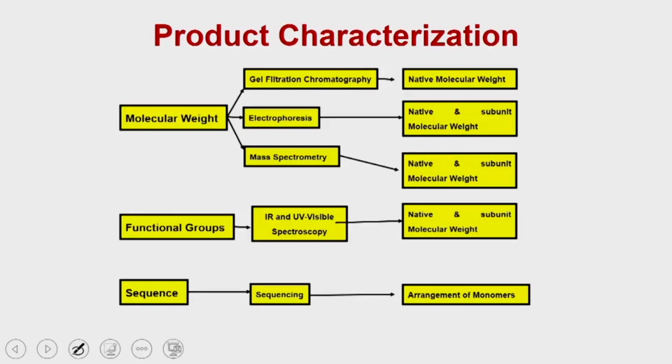Now, we are going to start the discussion about electrophoresis. Electrophoresis is going to be used to calculate the native as well as the subunit molecular weight. Before getting into the detail of electrophoresis, let me explain what electrophoresis is and how electrophoresis as a technique evolved.